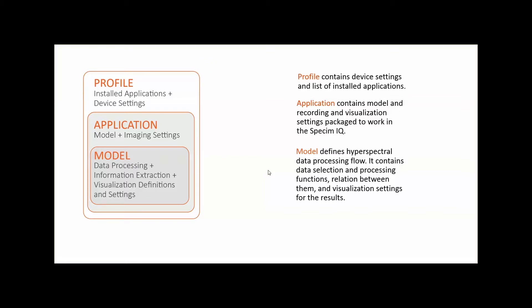The application then defines how the data recorded with the Specim iQ camera is visualized and saved. An application combines the model settings with the imaging settings.